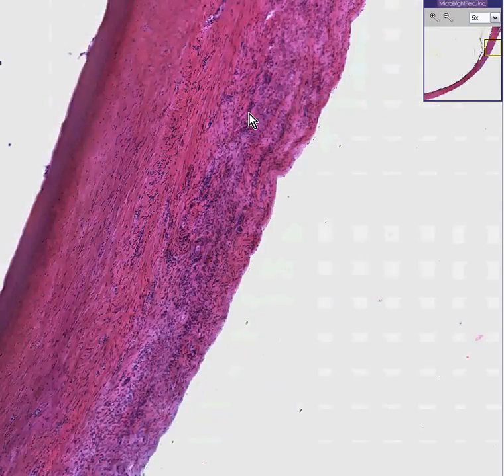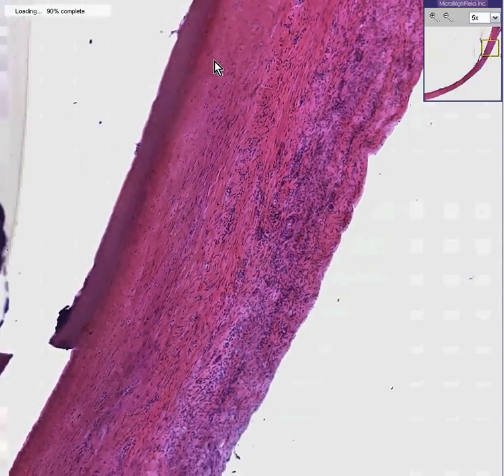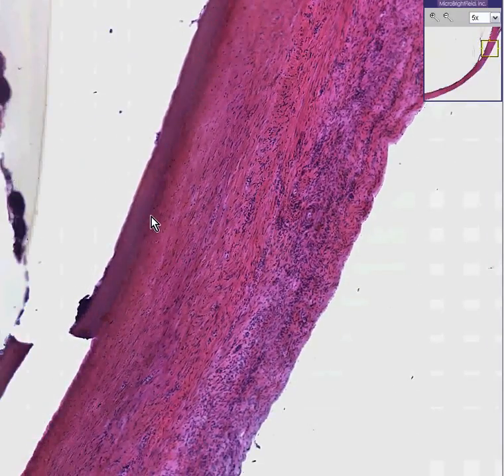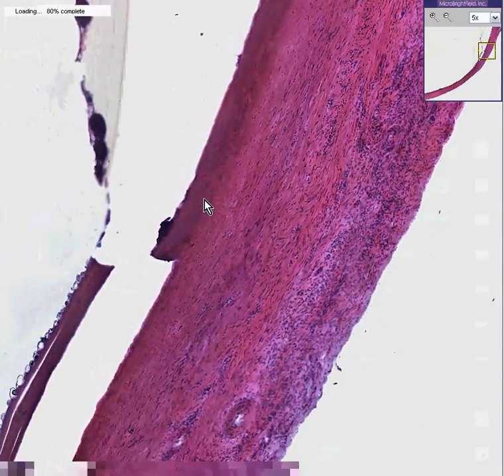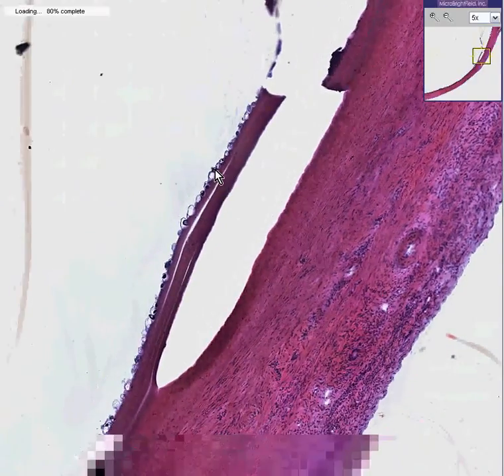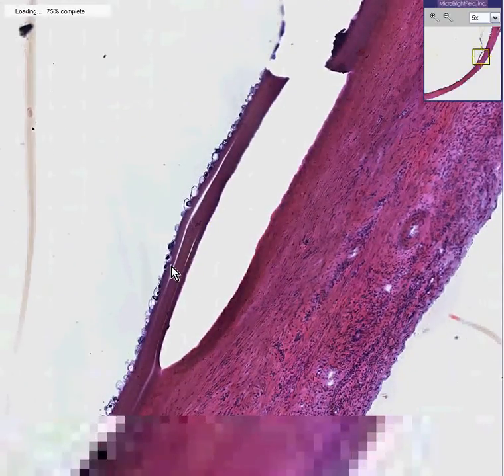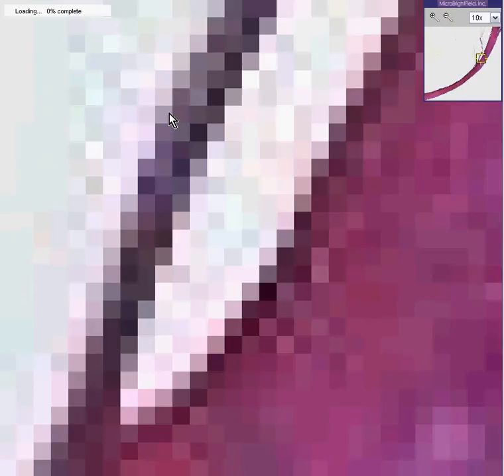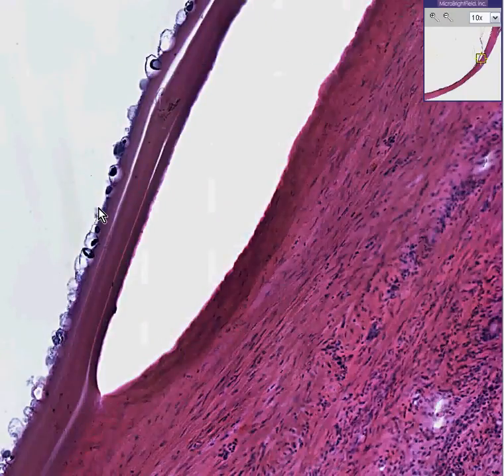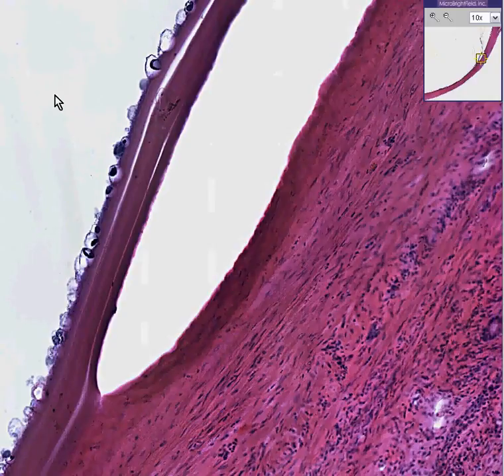It might be a little bit darker here because there's more of either a foreign substance, or perhaps — my god, what do we have here? It's not boring anymore. You see tiny little cysts or organisms along the edge of the wall. So this is classically what an echinococcus cyst would look like within the liver. They're also called hydatid cysts — hydatid because they're chiefly water on the inside. And here are the little larval forms of the tapeworm right here.